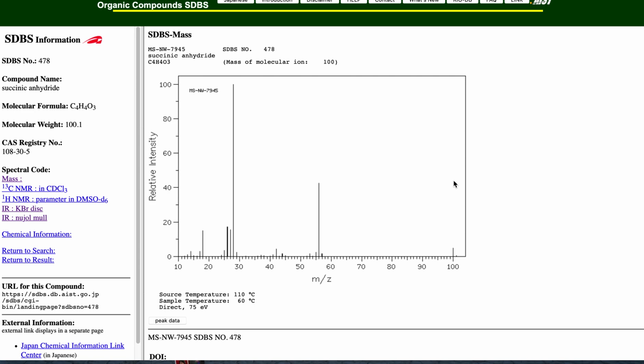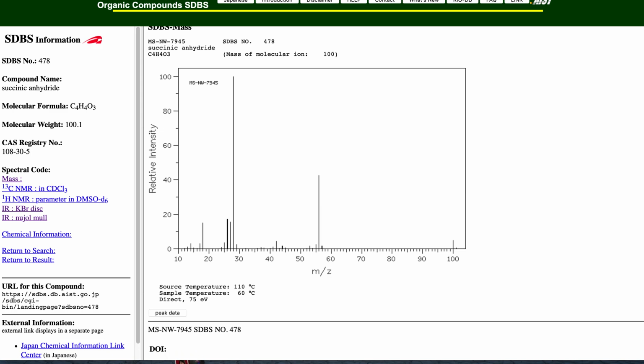And organic chemists, some of them specialize in structure determination. They don't do synthesis. They specialize in applying advanced techniques to determine the structure of an unknown compound. So you get a bar graph, and later on you'll see that's the molecular ion, and this is the base peak. That's your mass spectrum.